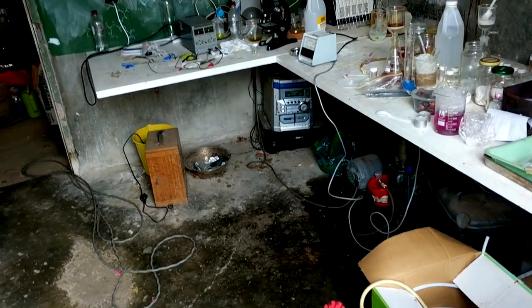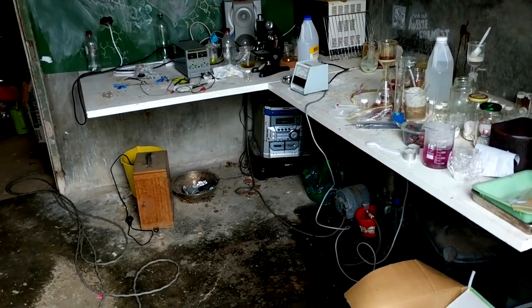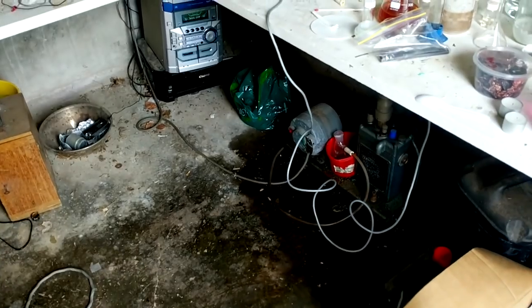Hello and welcome back to Engineering and Fire. We have some very trashed lab benches here today but the good news is we're not actually going to be dealing with anything on the lab bench — we're going to be dealing with the stuff underneath it.